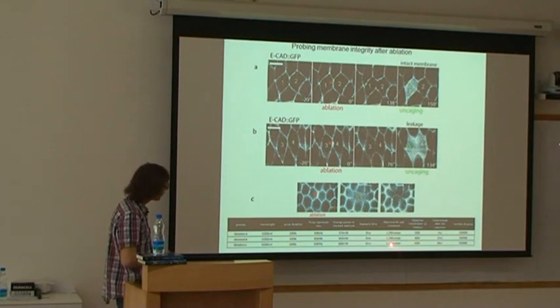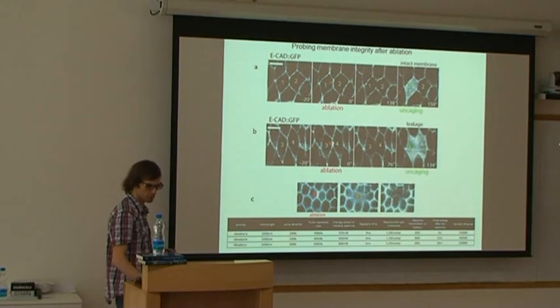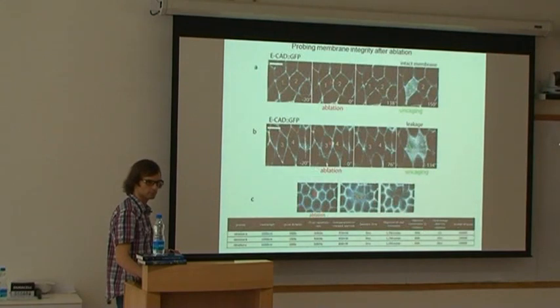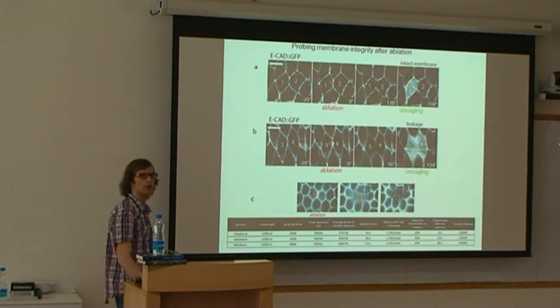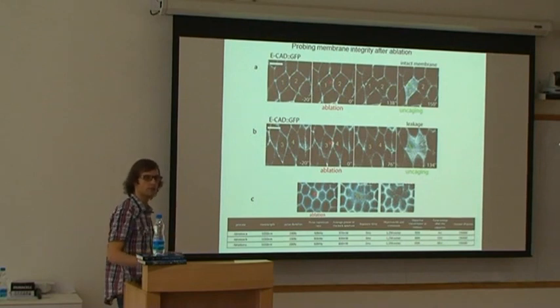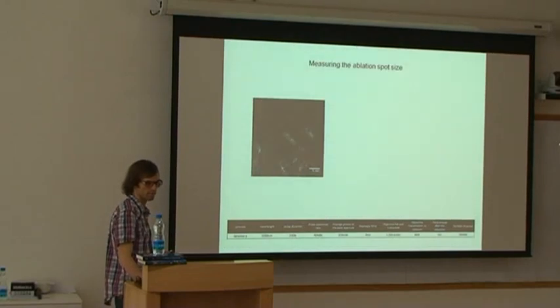In fact, you will see here what I'm doing. I'm increasing the average power, okay, from the first to the last experiment. I didn't measure it. I didn't spend too much time. For me, it was like a binary control. If I have membrane breakage, I will not take it into account. If I do not have, then I will take it into account. But I didn't go in and analyze that more carefully.